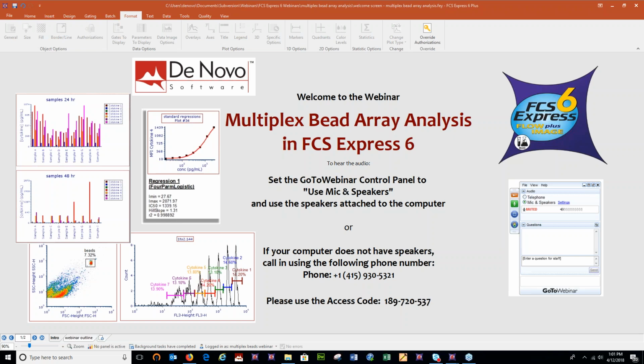The advantage of doing it all in FCS Express rather than in another flow software is that everything is going to be self-contained in FCS Express. So there's no need to analyze your FCS files in a flow program and then export that to Excel. And then many times you have to spend additional hours taking that data from Excel and putting it into other statistical analysis programs like Prism or StatView or what have you. If you count up the hours that you spend doing that, especially if this is something you're going to be doing even on a semi-regular basis, it really does take a lot of time. So we try to provide as many tools as we can for you under the same umbrella of FCS Express. And I hope I can sell you on the idea of doing it all in the software that you presumably already own or are trying out.